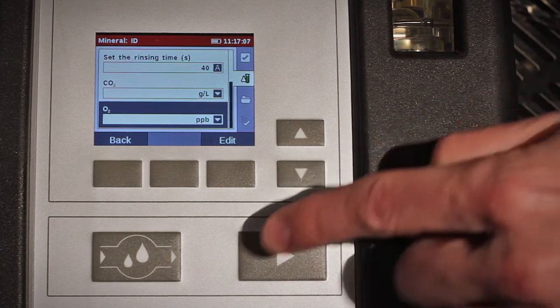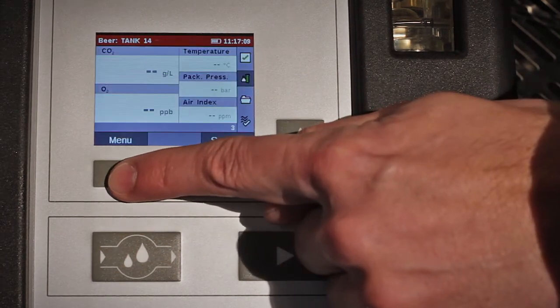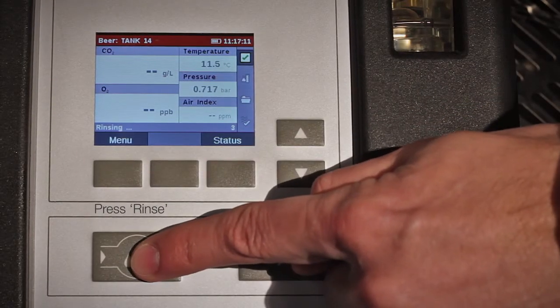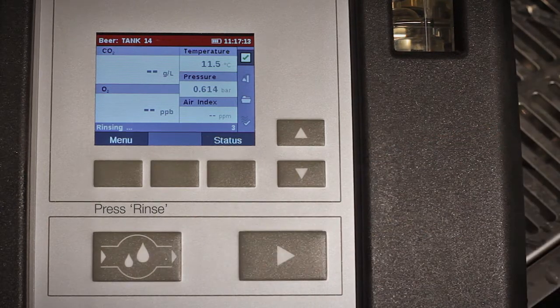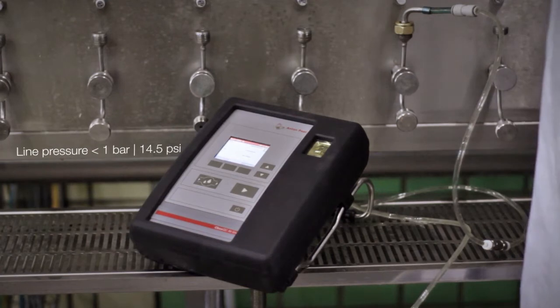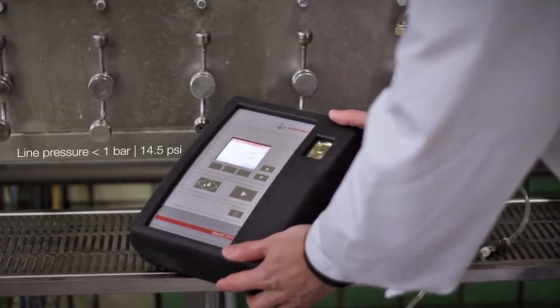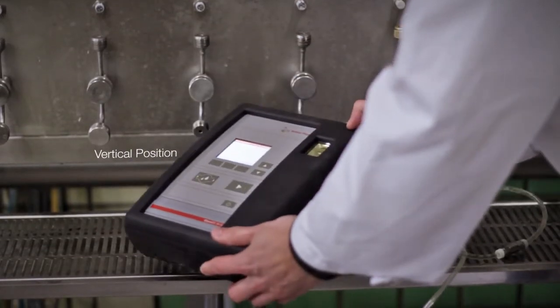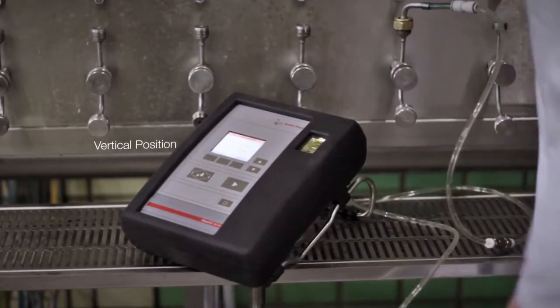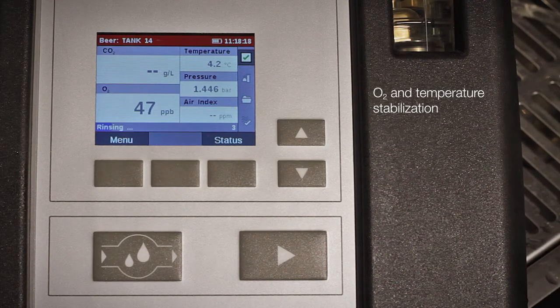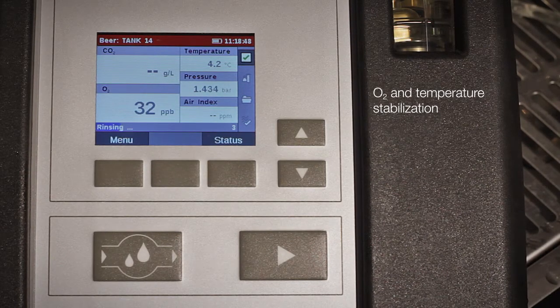Before the first measurement, perform a pre-rinsing process as follows. Open the sample valve at the line or tank and press the RINSE key. If the pressure level is lower than 1 bar or 14.5 PSI, position the instrument vertically to ensure bubble-free filling. Wait until the displayed oxygen and temperature values are stable.